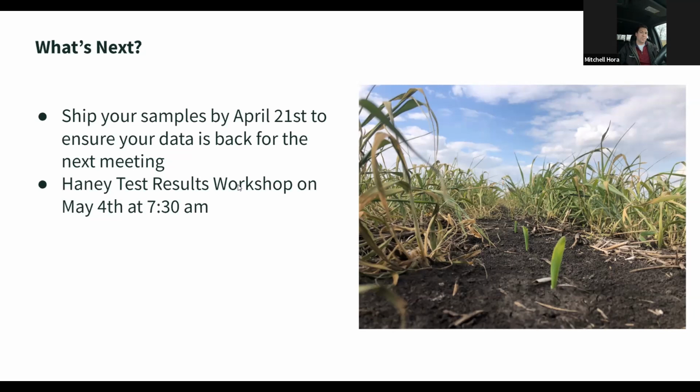It's typically easier to go from a probe or a shovel into a bucket and then into the paper bag. So just one other tidbit there. A 5-gallon bucket works, or we use feed buckets, so whatever you've got available. The key is to make sure that you get a good representation of the area. You don't just want to take a shovelful, like a clod of soil. It's probably not going to be representative of what you're trying to learn about. So as you're out there, have fun with it, dig around and see if you can find some worms.